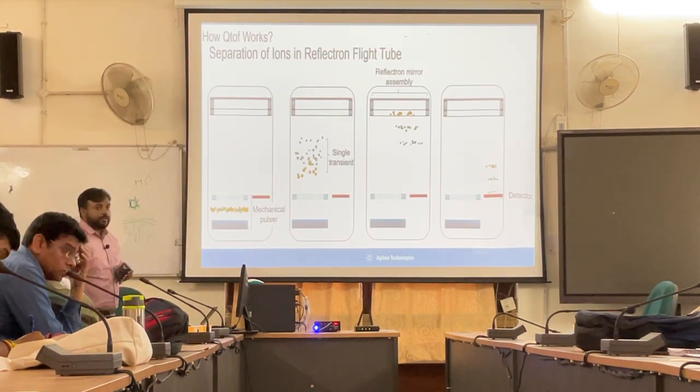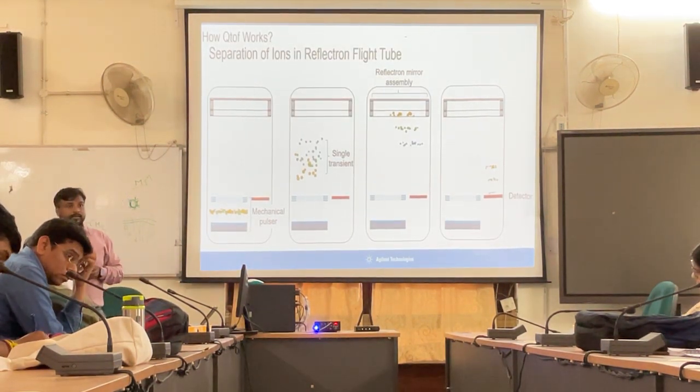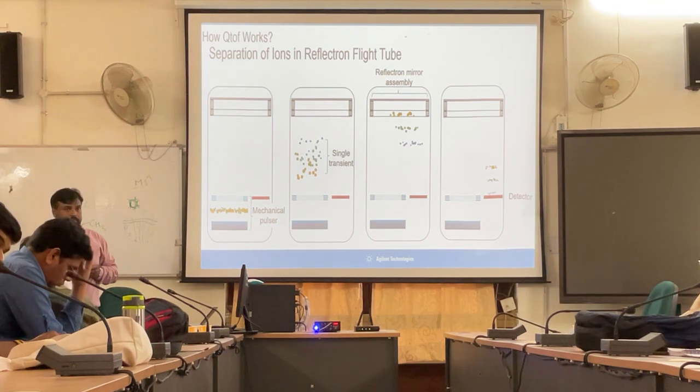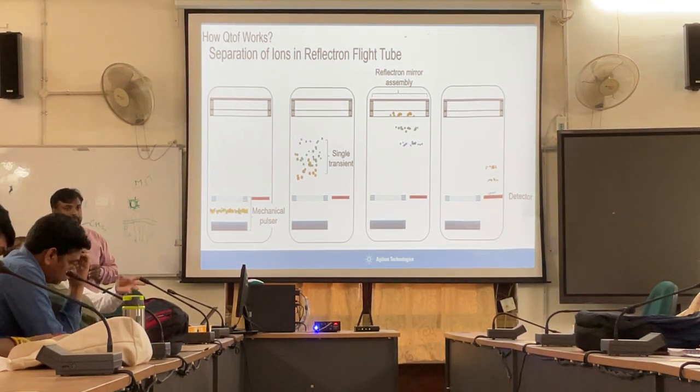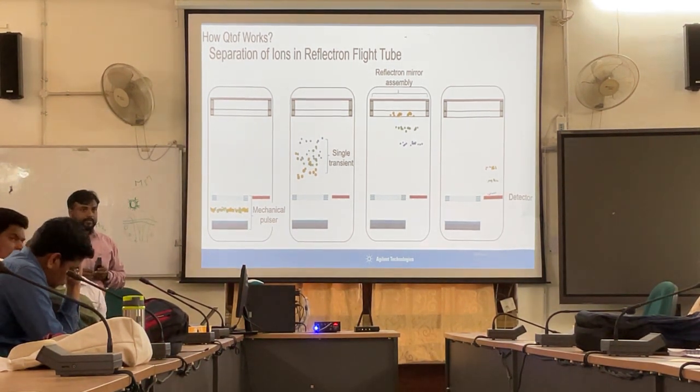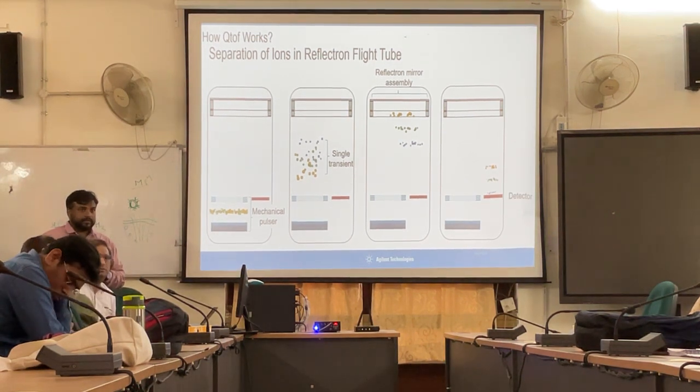What is the general standard sample you use to understand the calibration of that instrument? So these are known synthetic compounds which are provided by us. There are 7 compounds, all synthetic compounds. Should all 7 be used, or just one of them? It all depends.